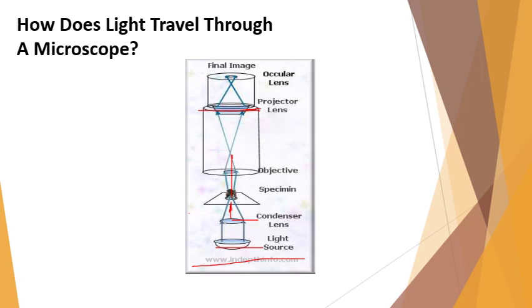So by using this lens, the image is inverted. Not all microscopes have a projector lens, so the viewer may be seeing a reversed image. In these cases, when the slide is moved, it will appear to be moving in the opposite direction to the viewer, and this happens due to the projector lens.